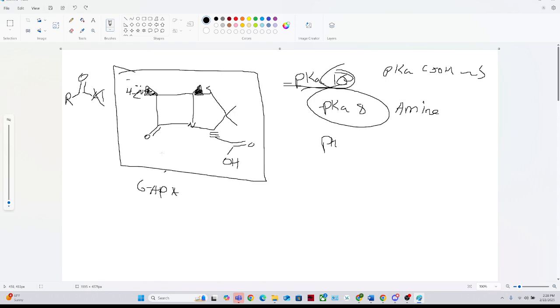And what we're going to be doing after this is recognizing what is and isn't the limiting reagent and excess reagent, because this will be beneficial for us during our workup procedure to see what we want to remove and how much of it we have to remove and what to expect on a TLC. So I'm just going to flat out tell you that the acyl chloride is the excess reagent, and your 6-APA is going to be your limiting reagent. So your excess reagent is in excess by 2 times.